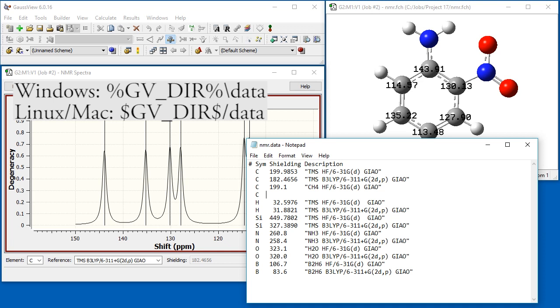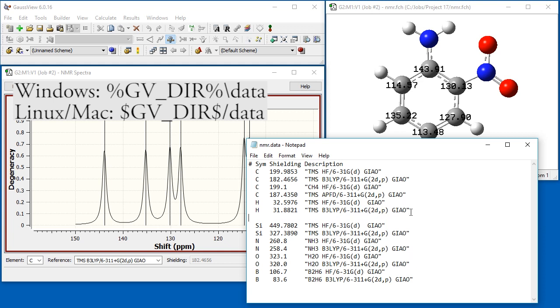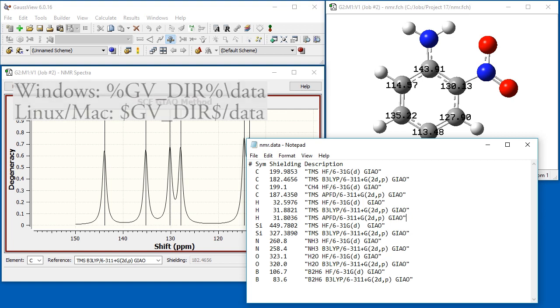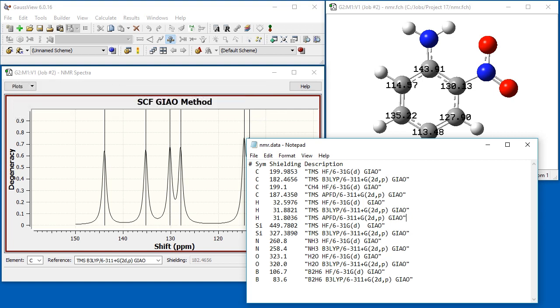We will add values for carbon and hydrogen from an NMR calculation on TMS using the APFD functional and the 6311 plus G2DP basis set. When adding values to this file, be sure to include sufficient significant figures.